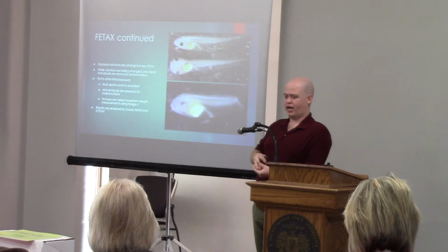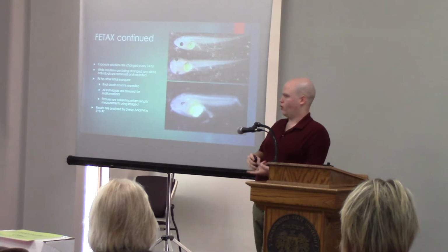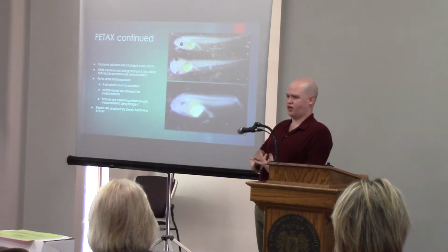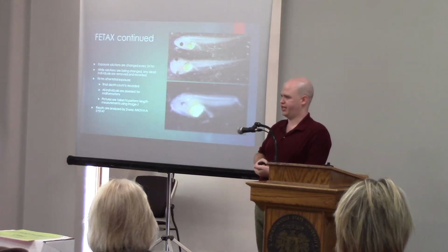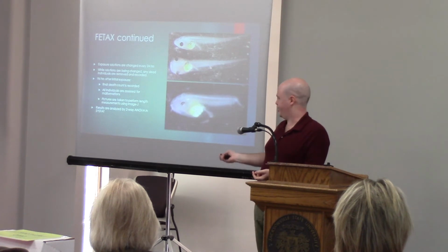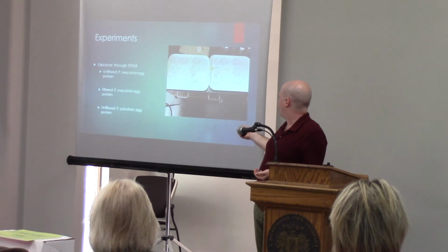We came in every day after 24 hours and gave them fresh solution in order to prevent that protein from breaking down. And we also removed any dead individuals that we found. After 96 hours, or 4 days, we did a final death count. We assessed all individuals for malformations, and we took pictures and used a software called ImageJ to assess overall body length to see if the protein concentration affected that. Then we used a 2-way ANOVA in Systat along with a Bonferroni post hoc and probit analysis to analyze our data. So this is what one trial of one experiment looked like right here with all these petri dishes.